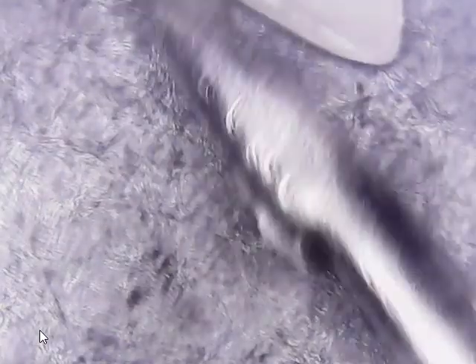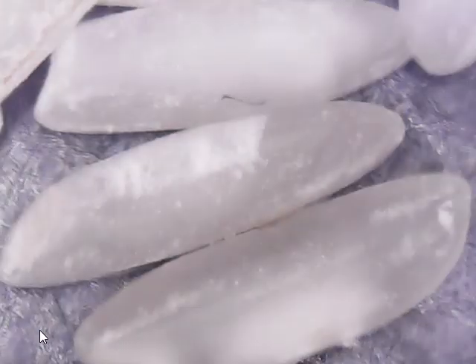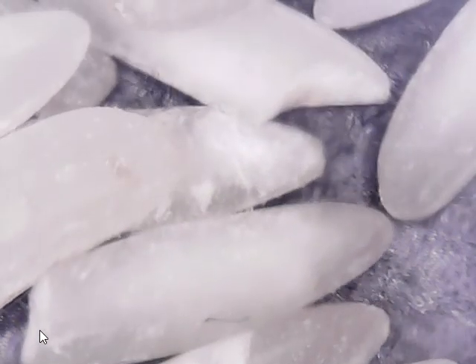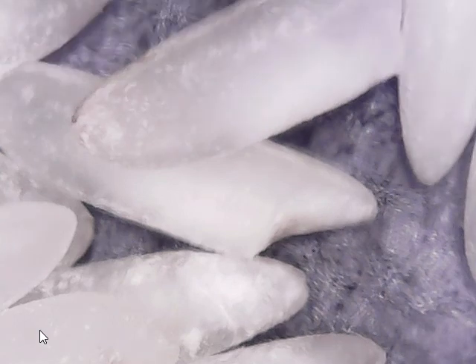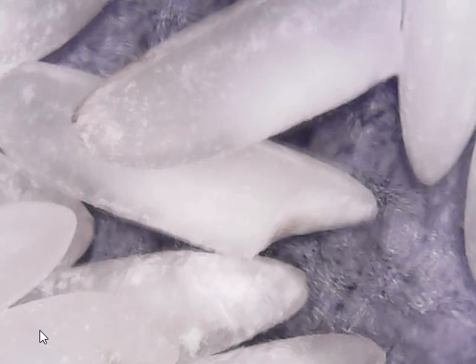Is this the one with the... that looks gross. Anyway, let's just move some more. That one has what looks like a hair on it. Wow, rice is pretty cool looking and yeah, it's rice, you guys.